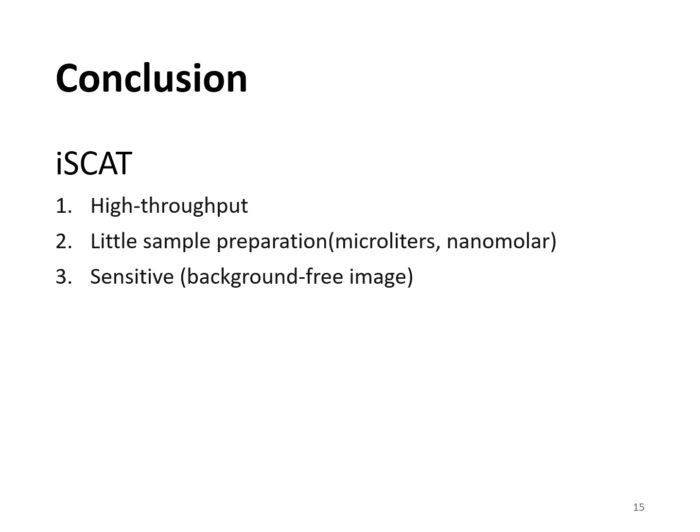Only a small volume and a low concentration of nanoparticle solution are needed. And the third is background-free signal. The use of interference scattering produces a clear signal that is less affected by background noise compared to traditional methods.